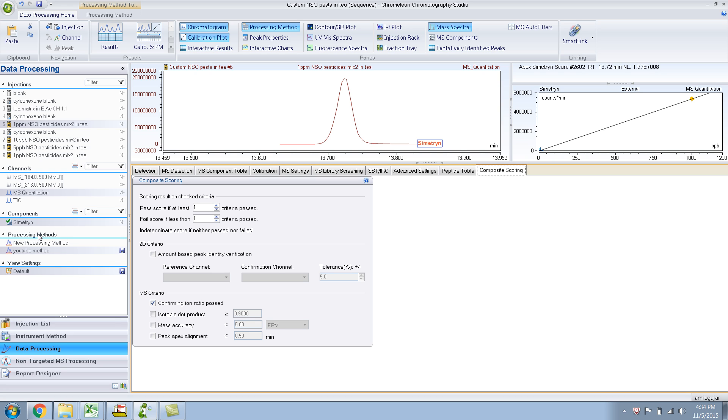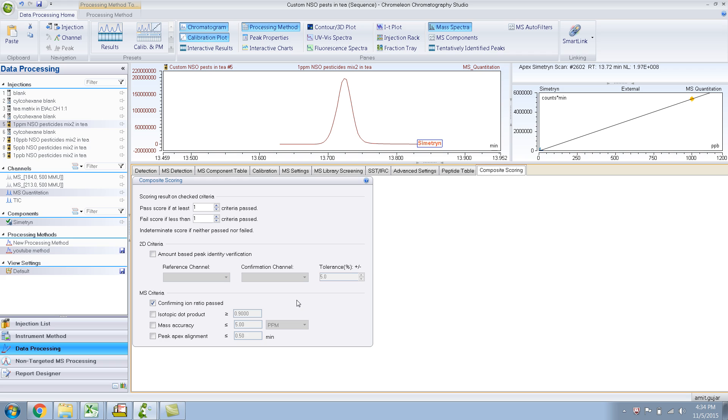For MS criteria, confirming ion ratios passed. If it doesn't pass, then this won't be green. Isotope, mass accuracy, peak alignment, peak apex alignment. Those are some other criterias.